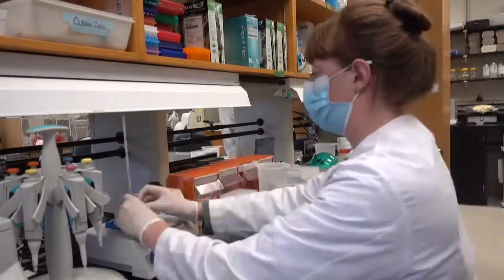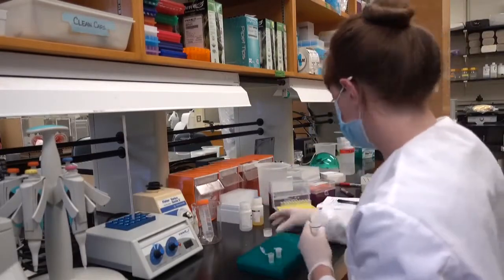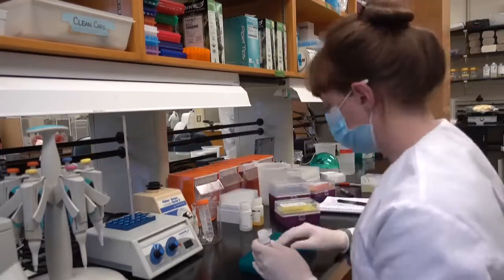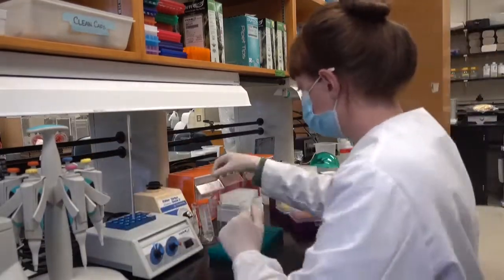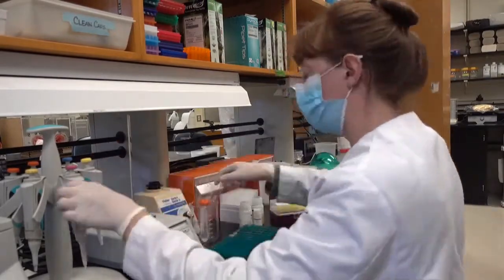And as hopefully you can see from all these sped up clips, this is a pretty extensive process. It requires me to pipette a lot of different buffers. And in general, this takes between two to three hours to do, depending on how many samples I'm processing at once.